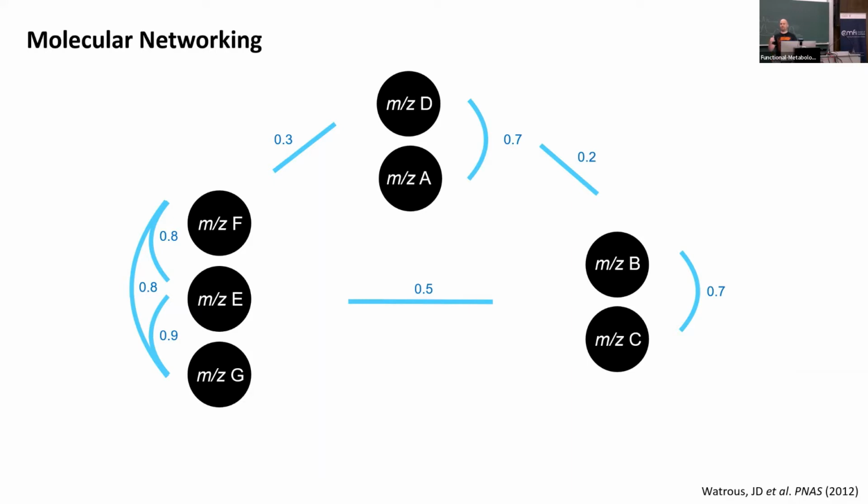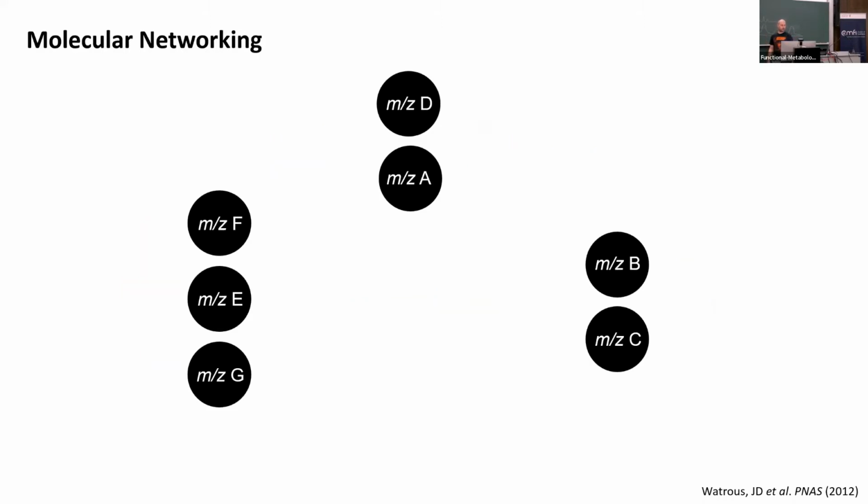Now, what level of annotation would that be? Probably, exactly, 3. A little bit lower, but this is really useful to systematically mine your data and bring things to your attention which you would not be able to capture yourself, because with DDA and these fast scanning instruments, we get thousands of MSMS per run. So you can simply not go through them anymore.